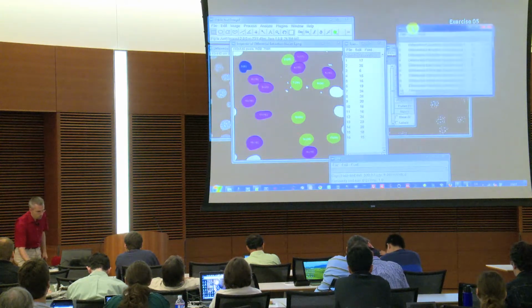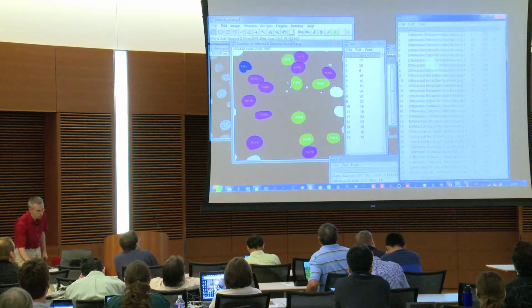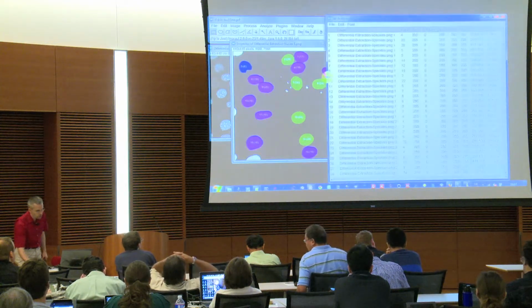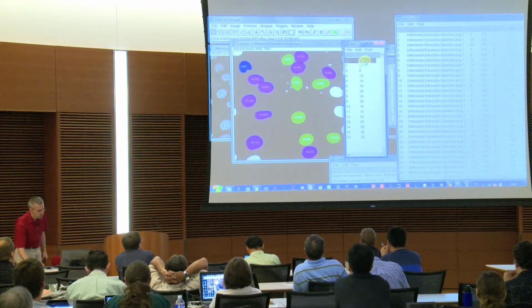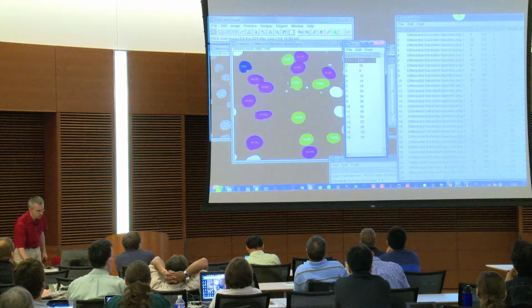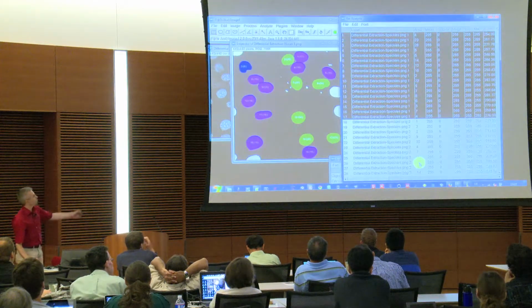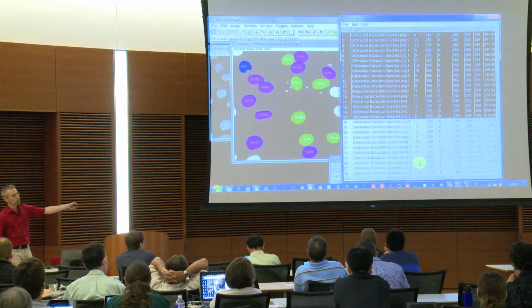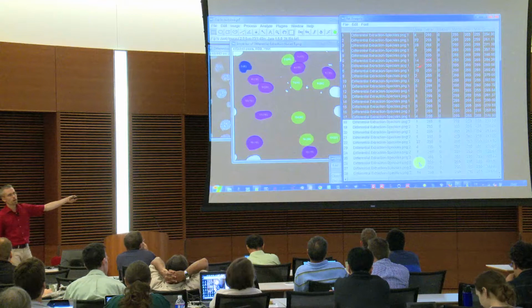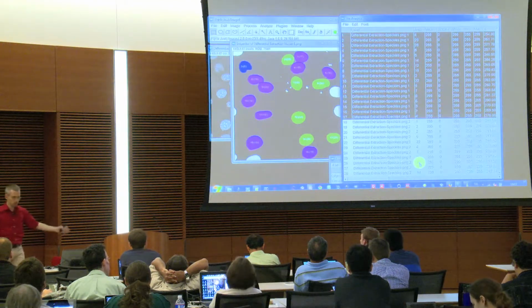We have also, if necessary, an individual analysis list of the speckles, so of only the small objects. So you see, in my first object, I actually had 17 small objects. If I go to my list here, then you see the first 17 have the number 1, then comes the number 2. So these belong to object number 1 and have the standard output for the analyzed particles, so all things you can analyze.